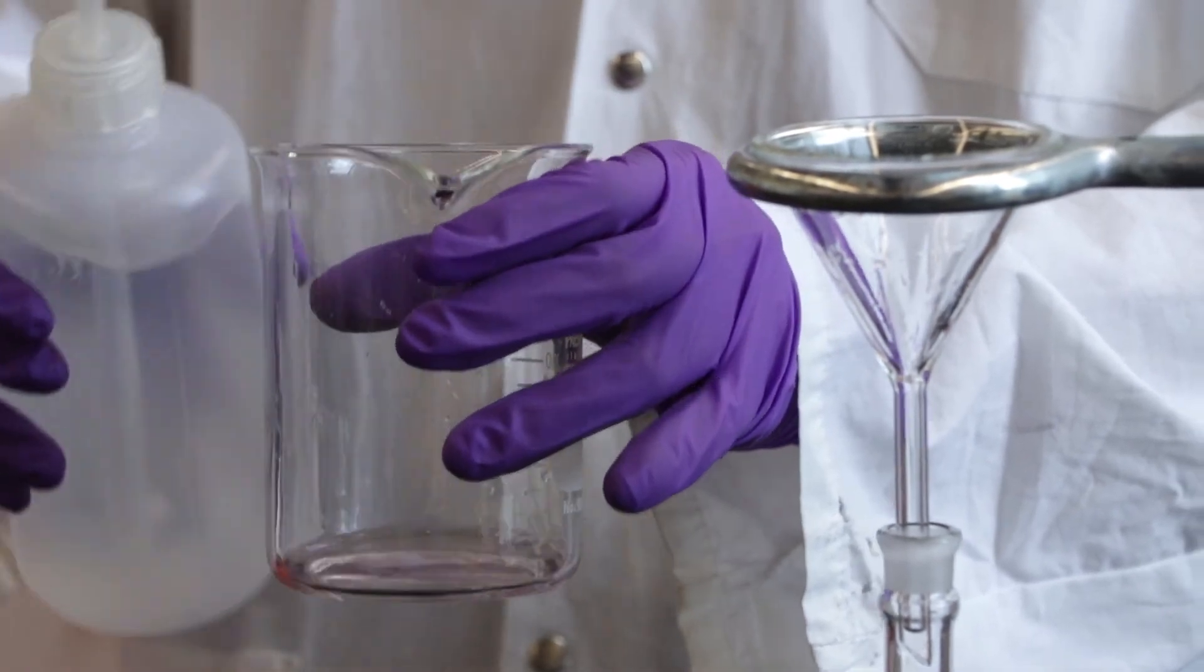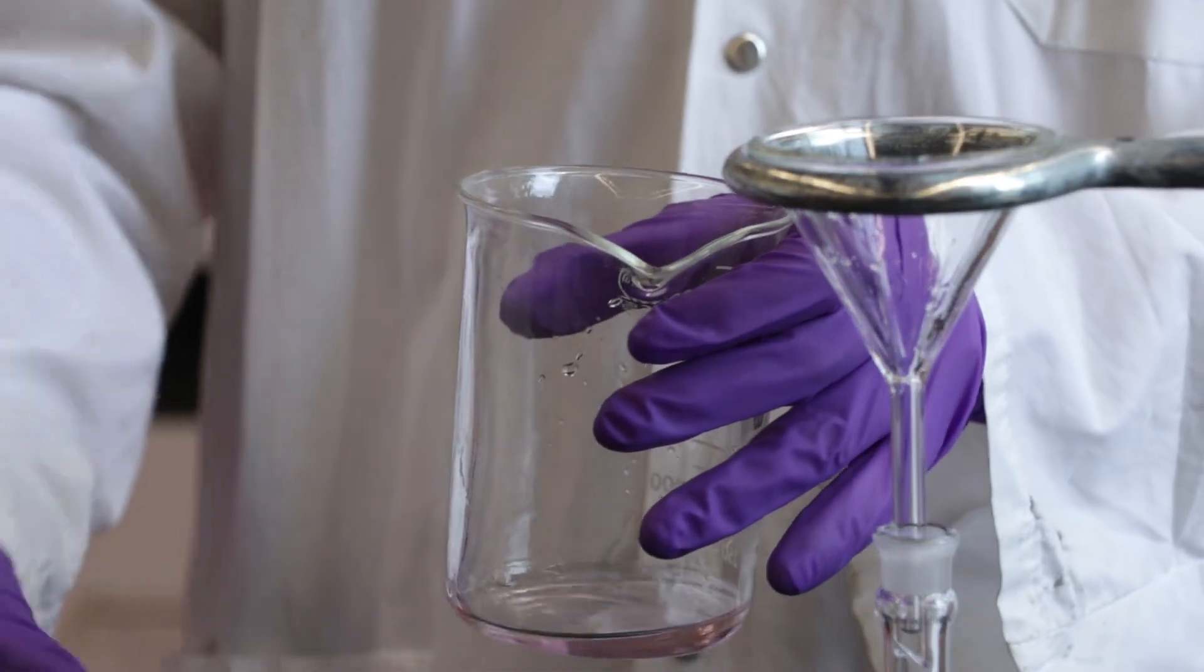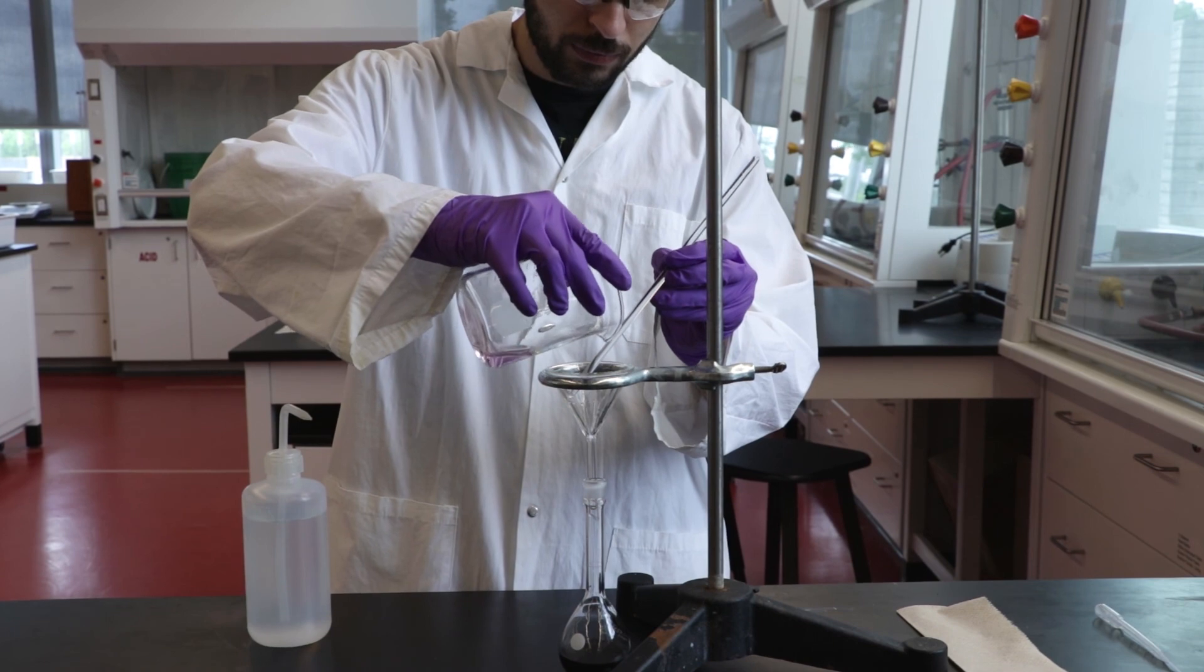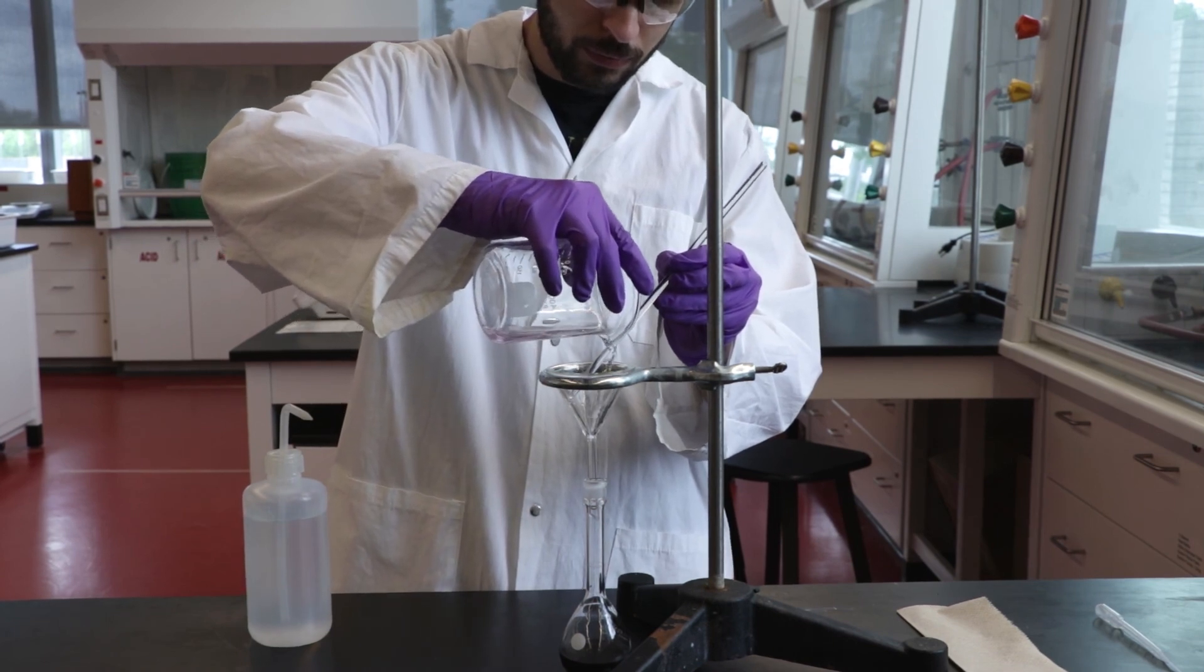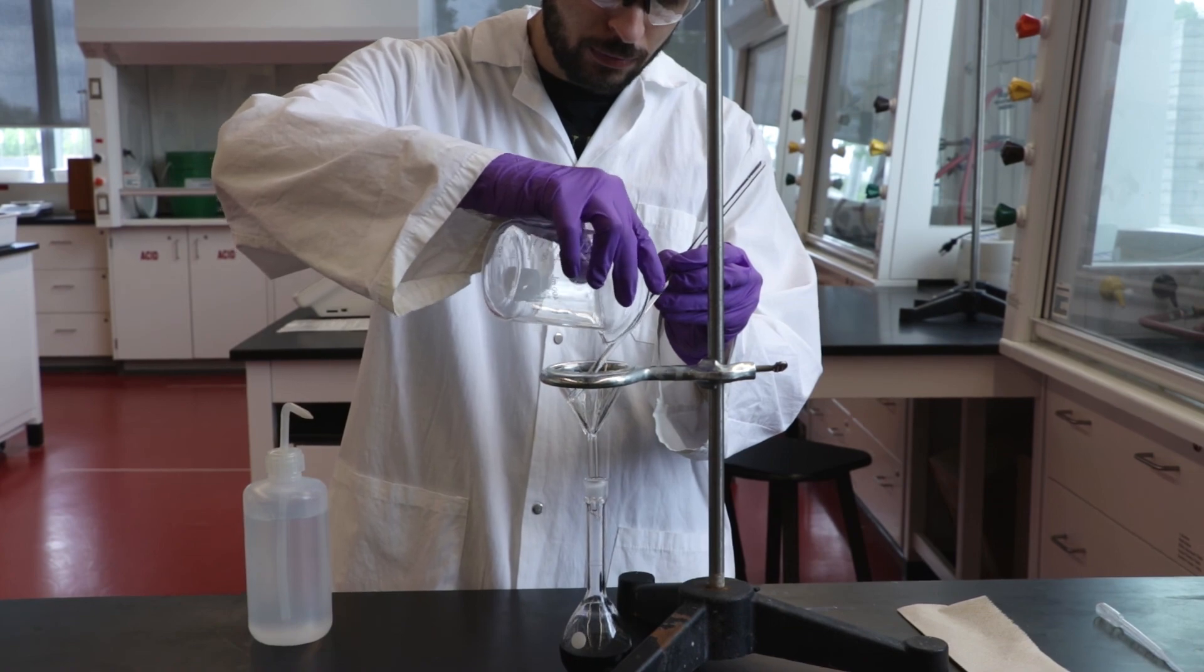Volumetric flasks are used to make solutions of accurate volumes within 0.01 to 0.05 milliliters. The flask in our example will make a solution which is exactly 100 milliliters in volume. Repeat the rinse until no residue is visible on the beaker.